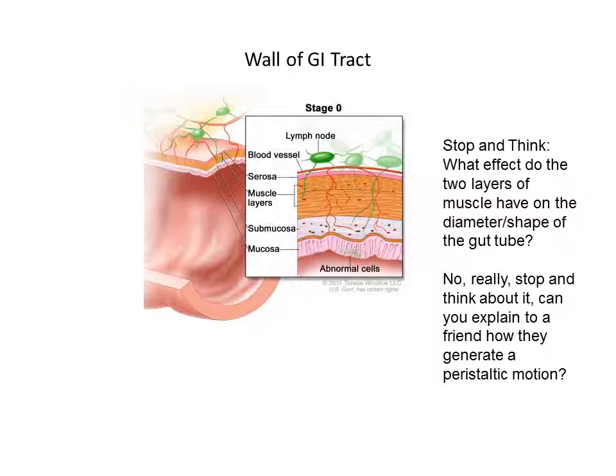So in order from the inside of the gut and going through their functions, there's an epithelium, with a lot of surface area. You'll notice the wrinkles in this tissue, used to absorb nutrients. That's called the mucosa. Underneath that is the submucosa. This contains the vasculature to help take the nutrients away from the system. Also, it contains other connective tissues to attach it to the other layers.